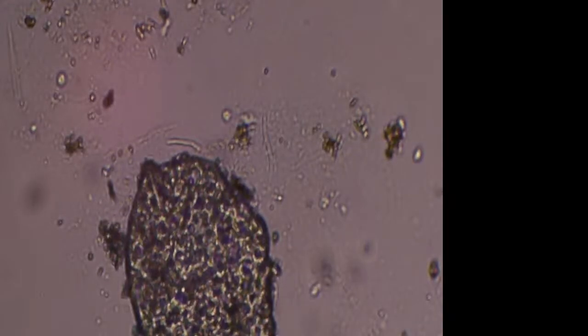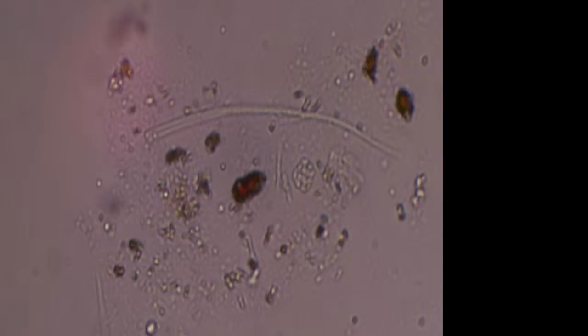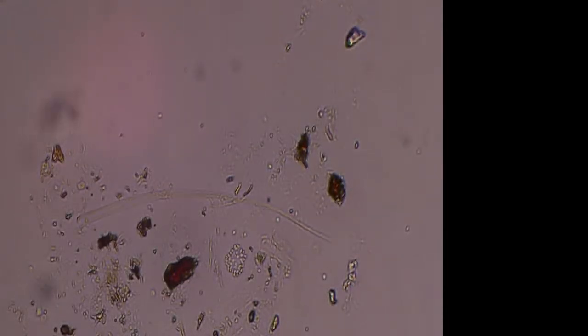There's that broken copepod again, looks like. You can see one of the antennae is still in shape there, right above what looks probably the eye spot. There's that little spiky bit there that tapers off.